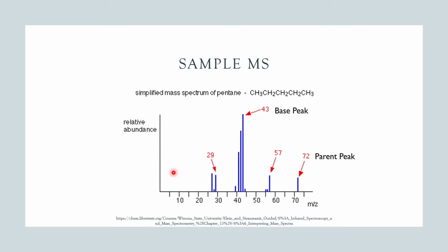And then you move through all of these mass numbers one at a time to see if any fragments actually hit the detector. Here we can see the first peak here, meaning that the smallest fragment that was detected on this mass spectra had a mass of 27. There's also a few fragments that had a mass of 28 and another one that had a mass of 29. In between, again, we move and get a stronger and stronger and stronger magnetic field.